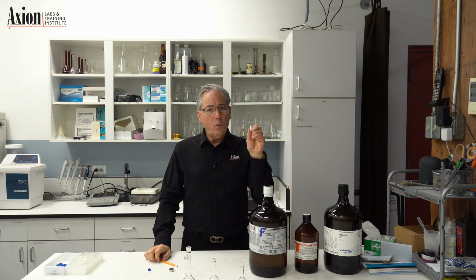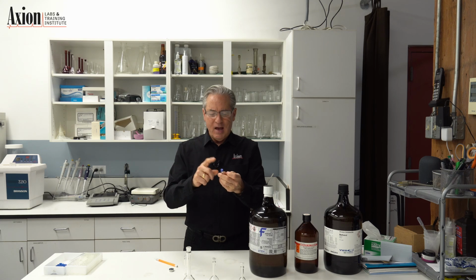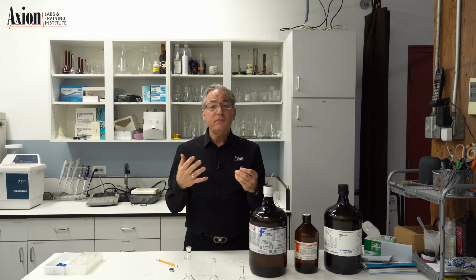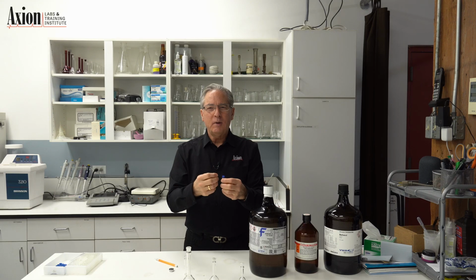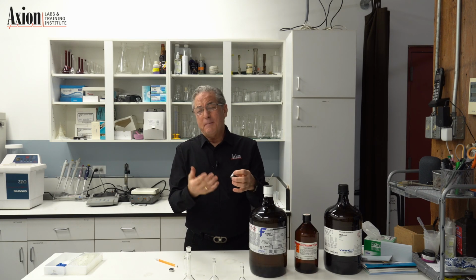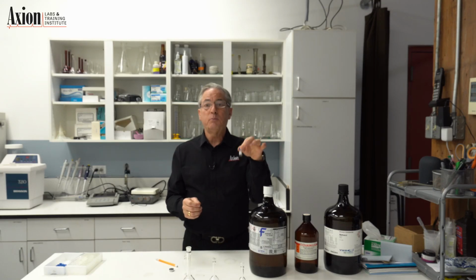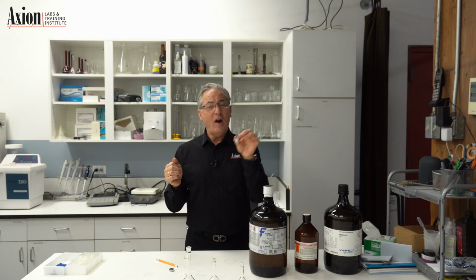So typically we put our sample in a 2 mil vial. We put the cap on with a septum. I like the screw caps just because, I don't know, it's me. I like the screw caps. Many people will use the crimp caps. That's fantastic. You use the crimp caps. When you crimp it, make sure it's tight. You want to make sure this is not leaking. We don't want the solvent to vaporize, because if that happens, then we're going to change the concentration. So most people in the world are going to put their GC sample in a vial like this, put it on the autosampler, let it do its thing. But that doesn't account for everyone in the world.